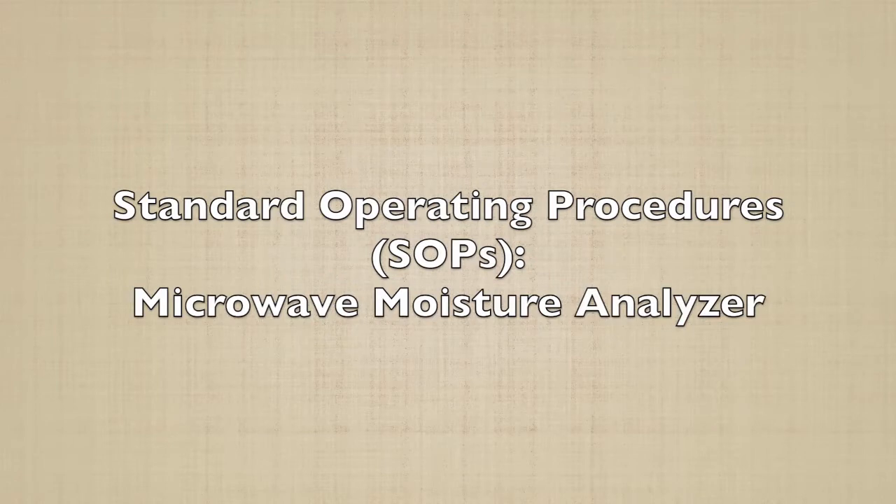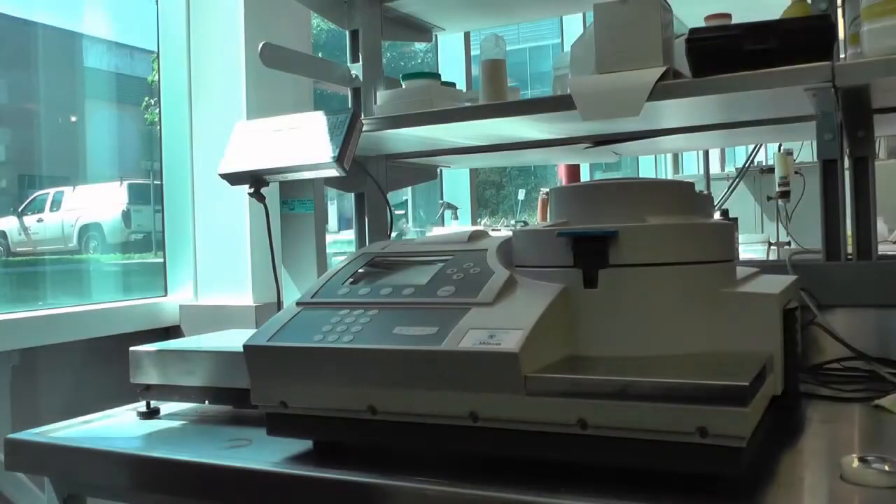In this video you will learn how to quickly and efficiently determine the moisture content of food samples using the microwave moisture analyzer.